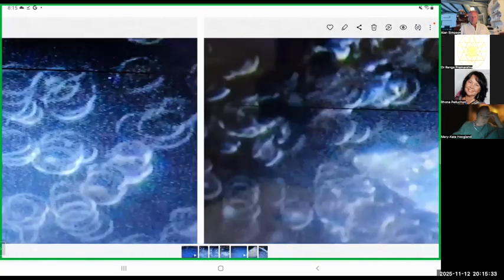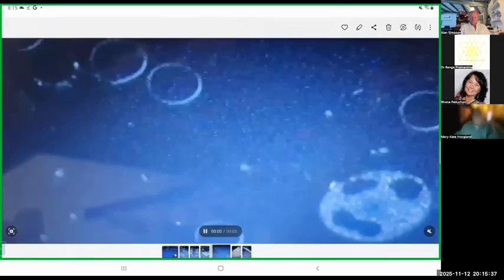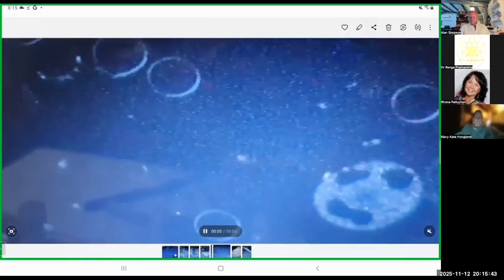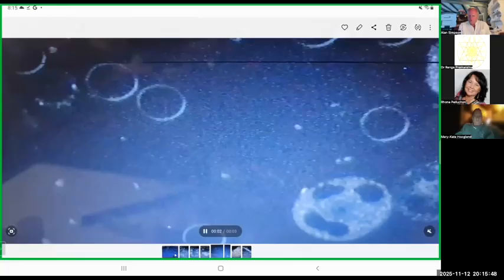This is a white blood cell. This shows a white blood cell, like a big white one with the black areas. These are the nuclei, the black areas. So that's a very active white blood cell. Isn't it wonderful?